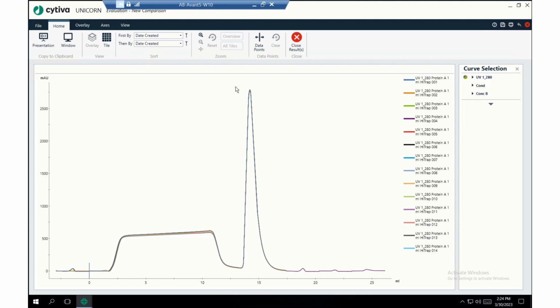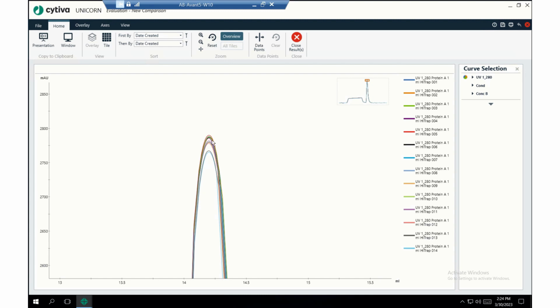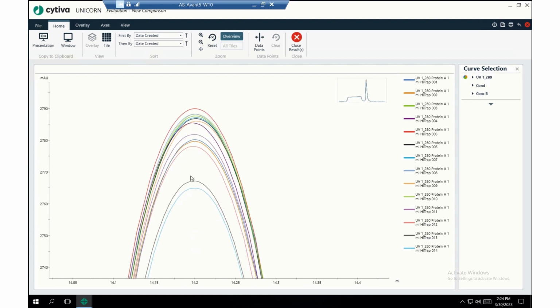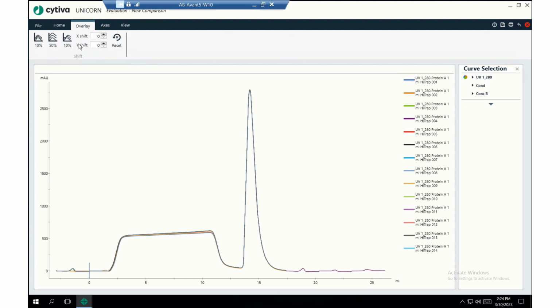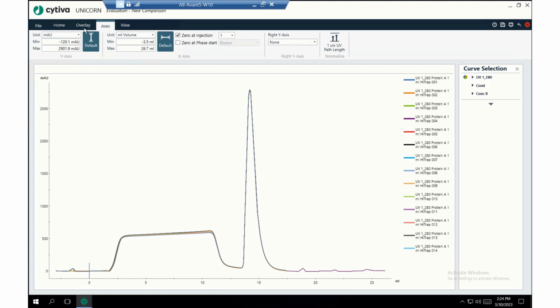Let's zoom in here on the tip of the peak so that we can see that there are actually 14 runs here. It's pretty good, but we're really zoomed in here. So let's reset this. Okay, and then if you do something like this on your own, it could be affinity chromatography, maybe 14 or 15 runs together, you just have to turn on the scouting for it, like in one of my other videos. If you do that and have something like this, I invite you to change the views. Like in the overlay section, you could look at having a 10% offset for these. And there's a few other things you can change in here that are really interesting.